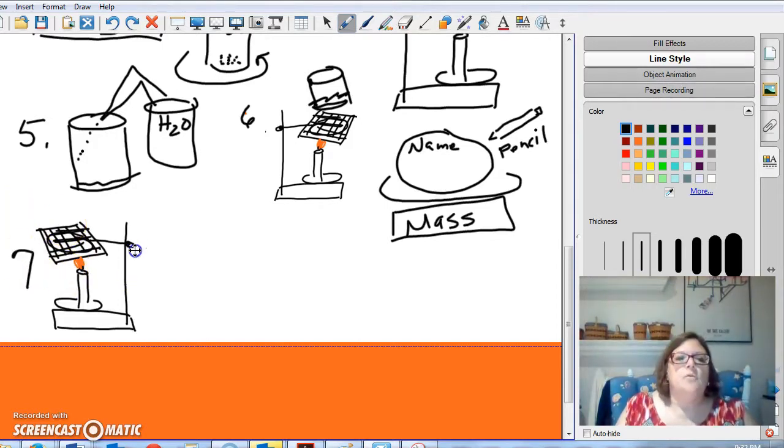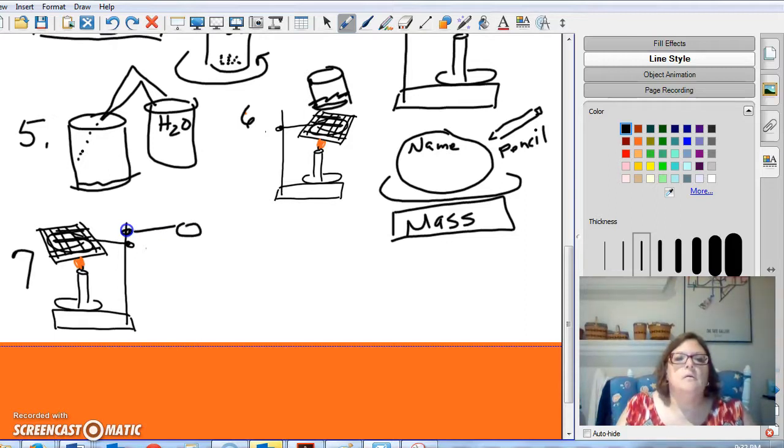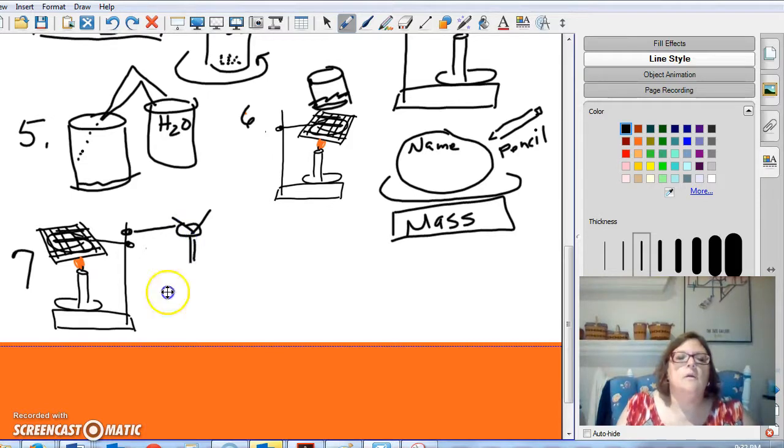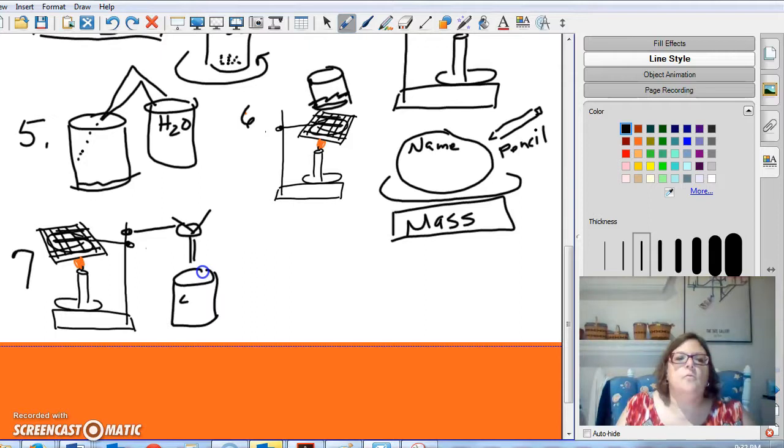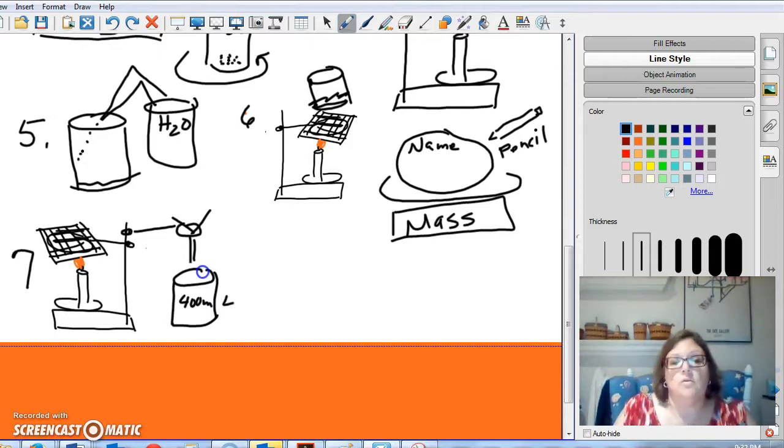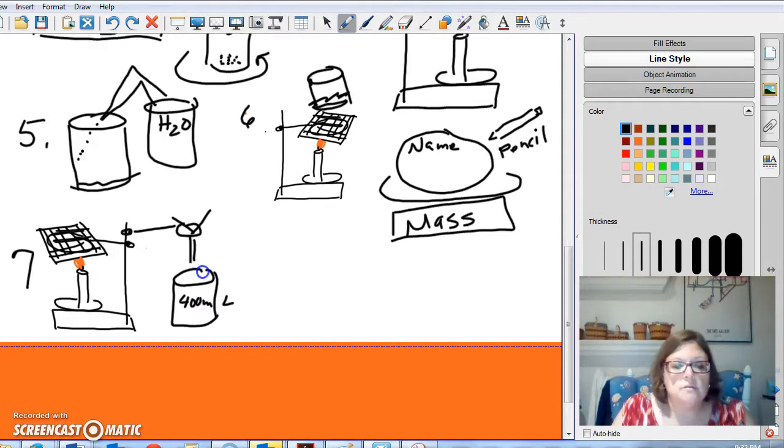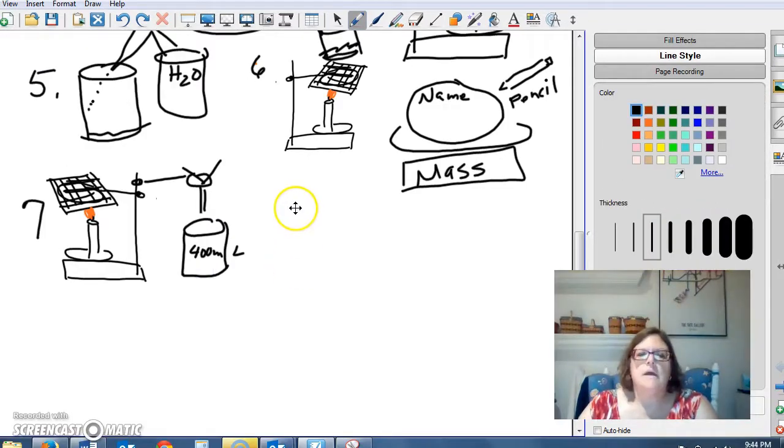For your filtering apparatus, you're going to have a smaller ring. And into that ring, you're going to put a funnel. And under that funnel, you're going to put a 400 milliliter beaker to catch your waste.